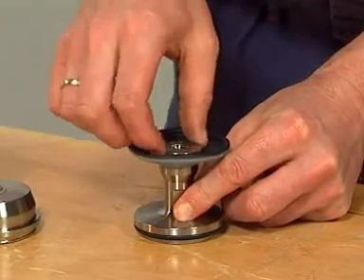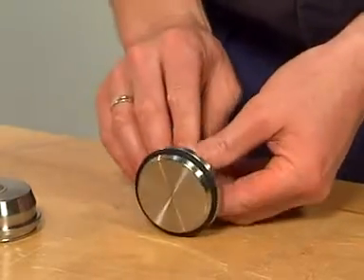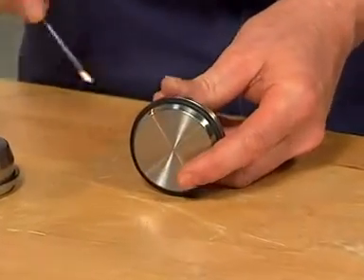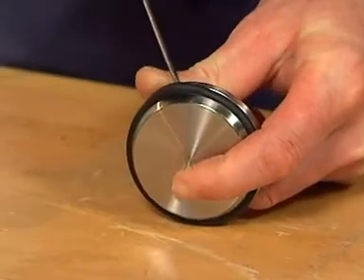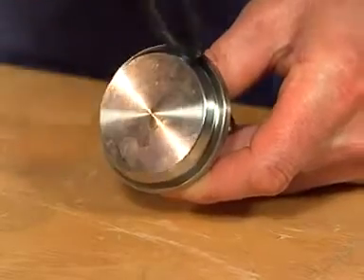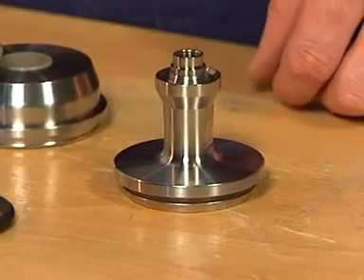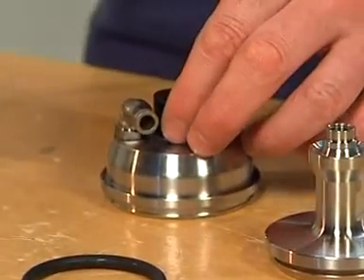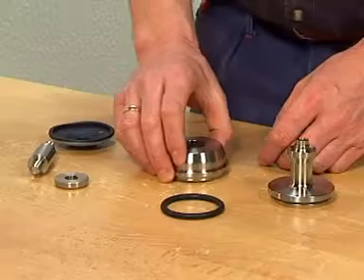Remove the support disc for the diaphragm and the diaphragm. Remove the plug seals — be careful not to damage metal parts. If necessary, remove the composite bushing carefully using a rubber mallet with the composite bushing tool. Tap gently until the composite bushing is removed.